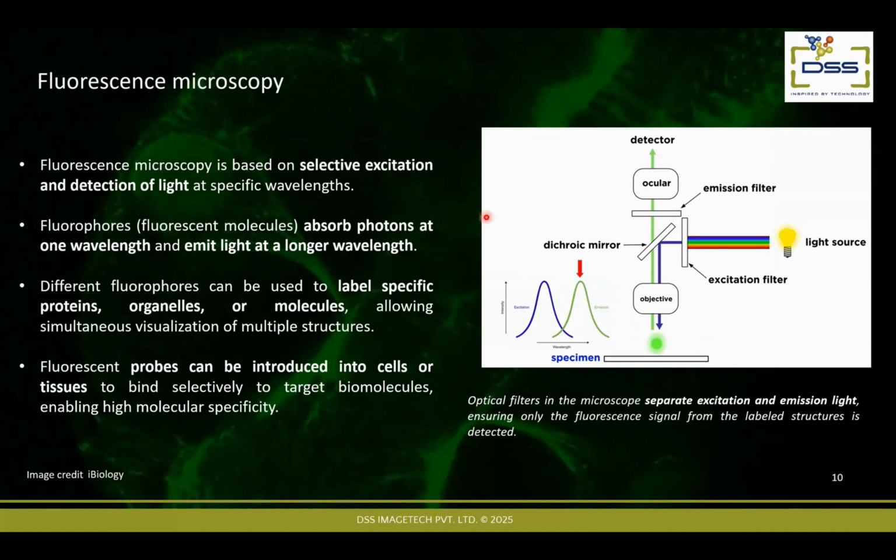Okay, so how does a fluorescence microscope essentially exploit the excitation and emission of a fluorescent molecule? Here we have a multi-wavelength light source, with different wavelengths being emitted from it, and an excitation filter. For example, if you are expressing green fluorescent protein in the cell, the excitation filter makes sure that only the wavelength needed to excite the green fluorescent protein is allowed to pass.